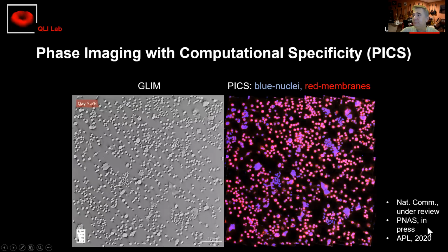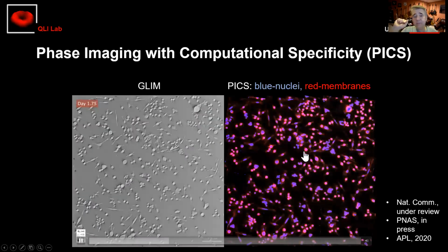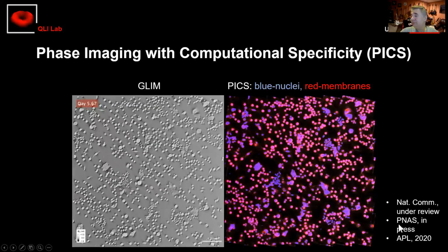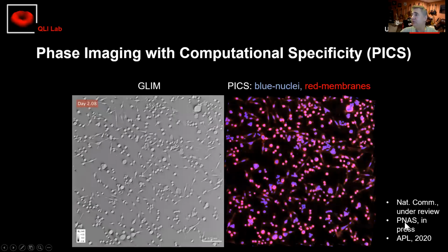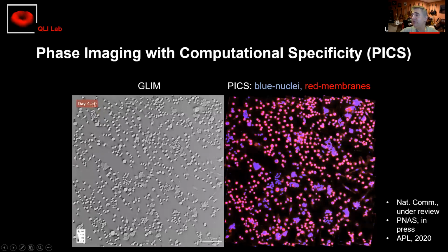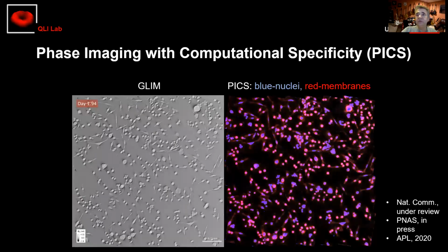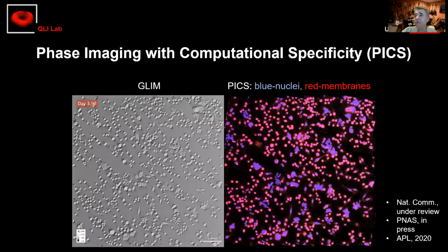In the meantime, we used the same idea to analyze subcompartments in sperm cells and select them for highest fertility. And this was accepted in PNAS, I guess, last week or 2 weeks ago. So this is going to come out soon. On cancer, we started to use this. We have a paper out on a simple cancer versus normal classification, just using artificial intelligence, that works with 98, 99% accuracy.